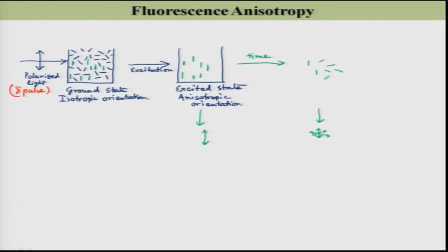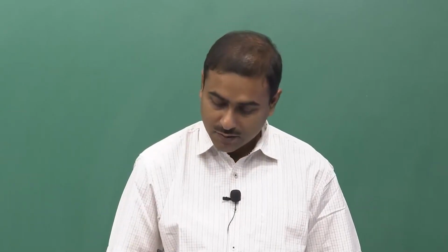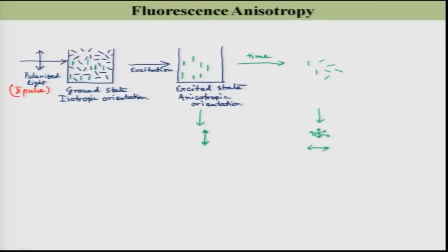In other words, there will be some contribution in the horizontally polarized emission. In the early time there is only vertically polarized emission, but as time goes, the contribution towards the horizontally polarized emission will increase. So, here I write vertically polarized emission.